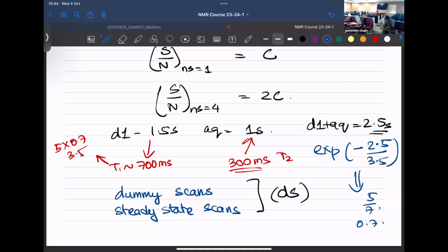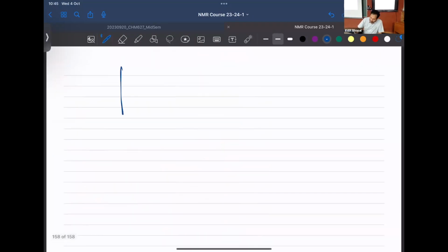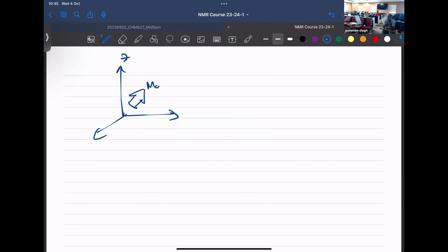Sir, when you apply a magnetization, if it starts from 90 degrees or if it starts from 70 degrees, to get a 90-degree pulse, shouldn't you apply a different amount of magnetization? So what are you asking? Are you telling me that, let's assume a case where the bulk magnetization is already tilted? Is that what your thought process is? Yes, sir. Won't the pulse make it even more? Yeah, these things could be quite different. For instance, it depends upon how you end up applying the pulse, whether relaxation has happened and all that.